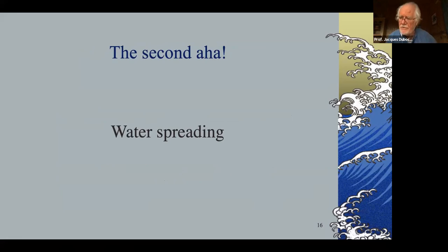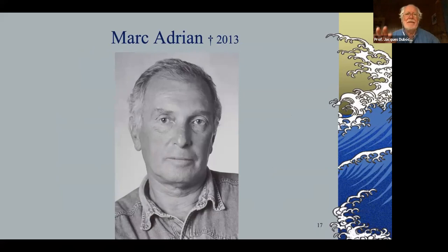We could prepare a specimen with that. And this was another important discovery made by Marc Adrian. And you know, at that time in our lab, we were expert in spreading water or liquid things on a thin supporting film. And this is some refined surface property of the supporting film and of the liquid. And Marc didn't like that. So he preferred having no supporting film. And I explained to him that this is impossible.